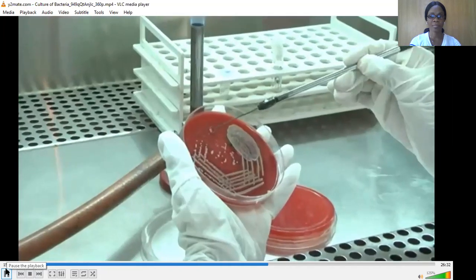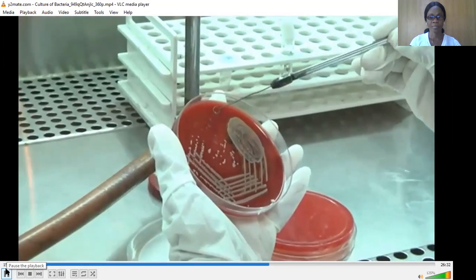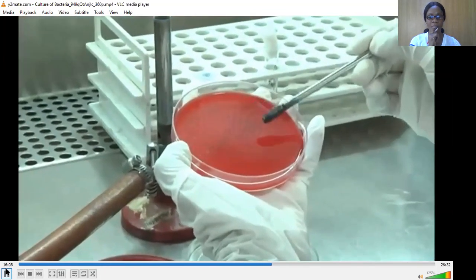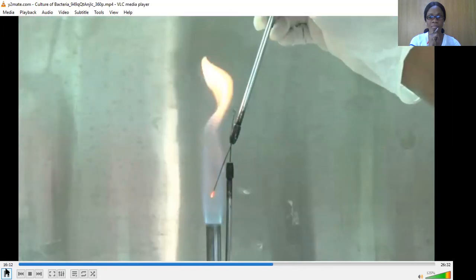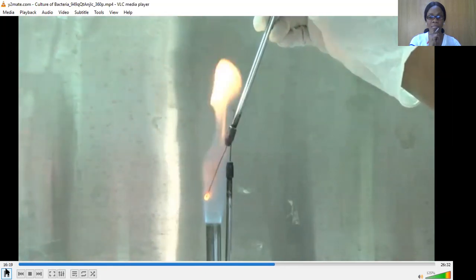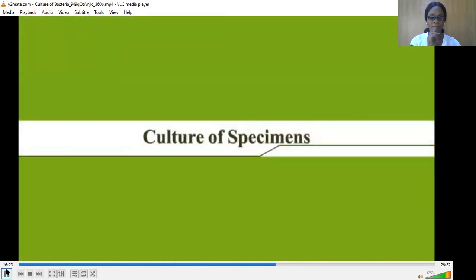Take a sterile loop and load it with a portion of an isolated colony on the primary medium. Transfer it to a suitable medium by the streak method, which has been described earlier. When making transfers during subcultures, it is advantageous to flame the loop between each set of streaks on the surface of the medium. This avoids over-inoculation and ensures the growth of isolated colonies. Culture of specimens.